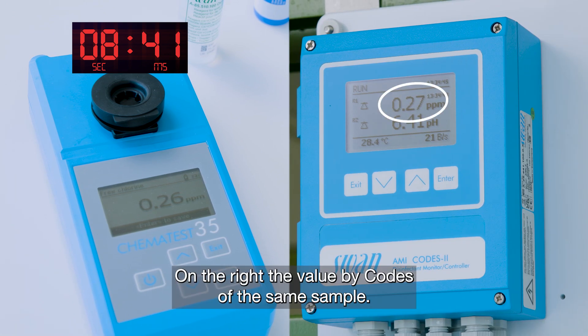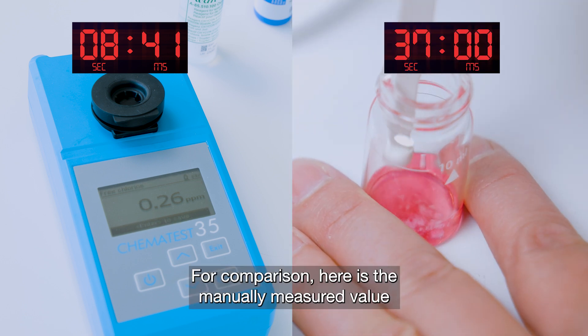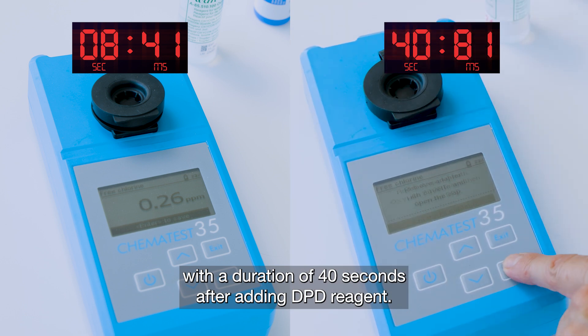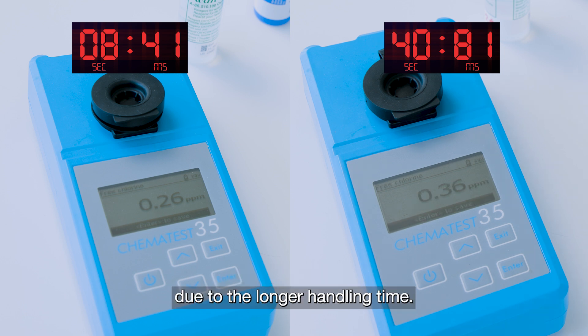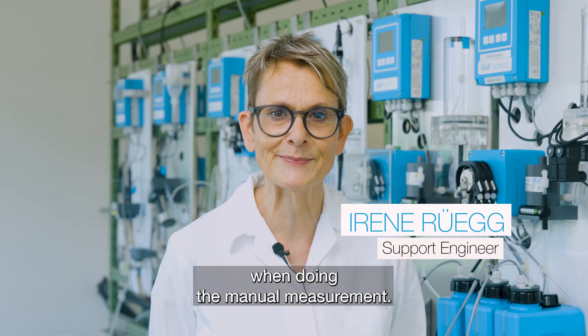On the right, the value by CODES of the same sample. For comparison, here is the manually measured value with a duration of 40 seconds after adding DPD reagent. The measured value is significantly higher due to the longer handling time. That's why it is important to move quickly when doing the manual measurement.